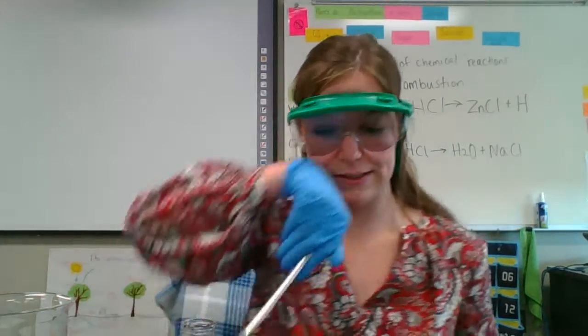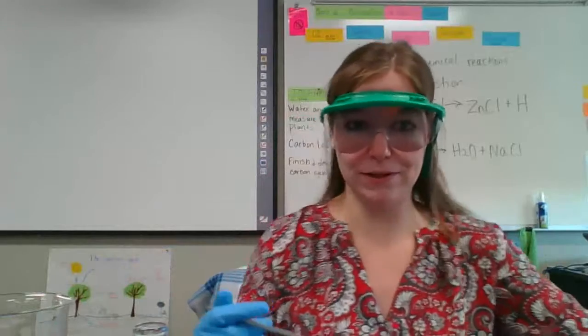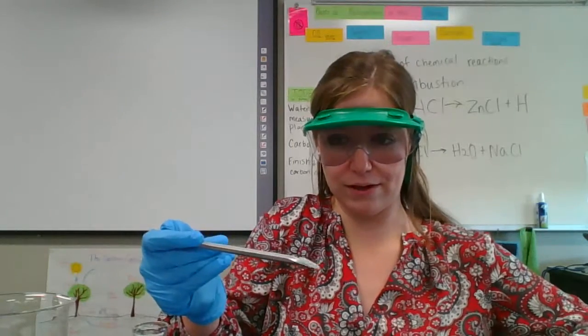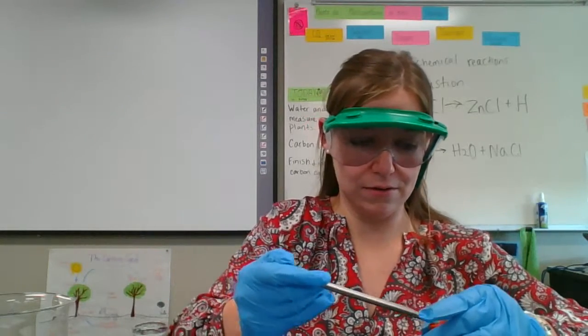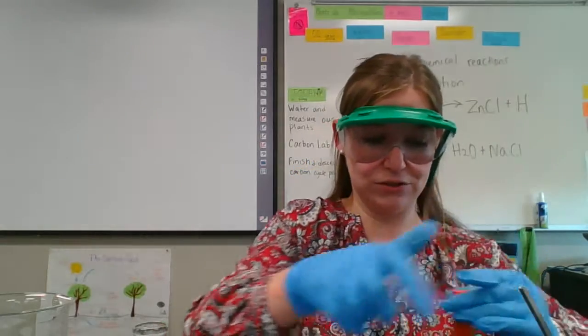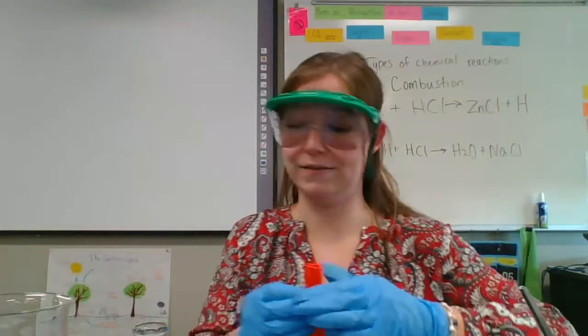So we're going to see that in a couple different ways. First, I'm going to get away from that. I'm going to take some zinc pellets, so you guys might be able to see this okay. All right, I'm going to put some scoops of zinc down in here. They're just like little silvery things, I'll try to put it close to the camera to see.